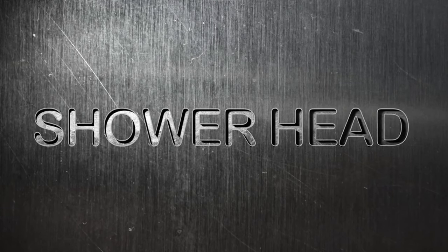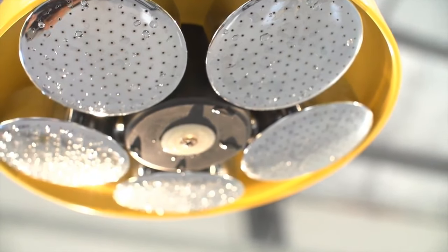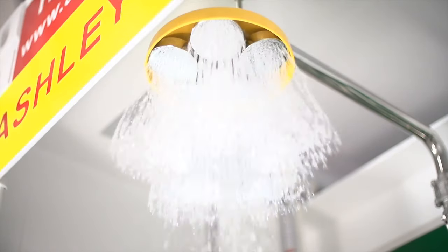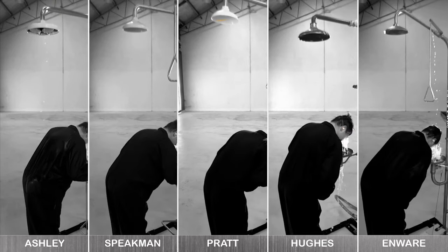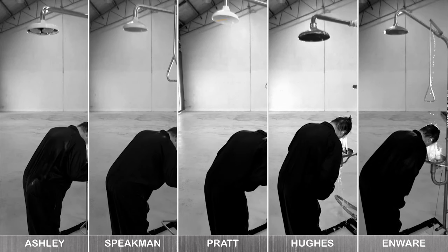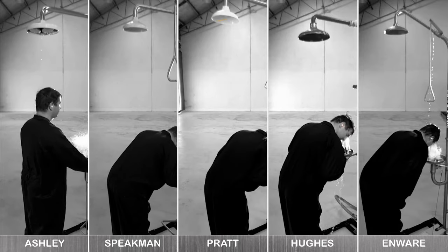Shower head: Ashley's shower utilizes a multi-head design which gives a smooth consistent flow that covers the required area better than single head designs. In order to examine the shower head effectiveness more closely, we've prepared a simulated chemical burns test to show you just how effective this design really is and how ineffective some designs can be.